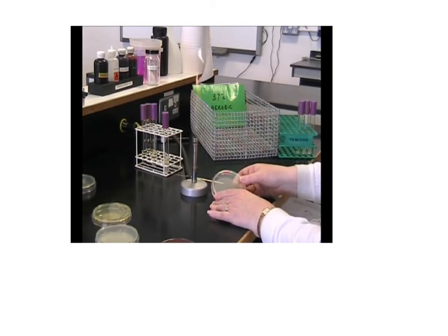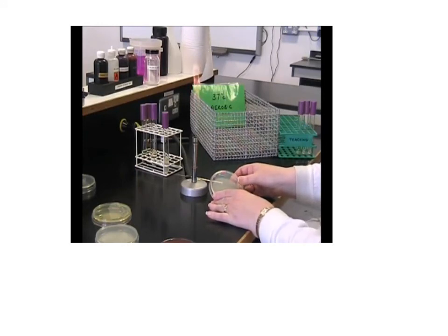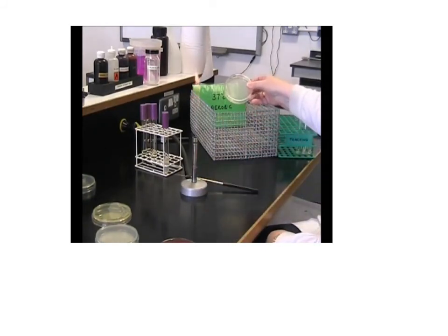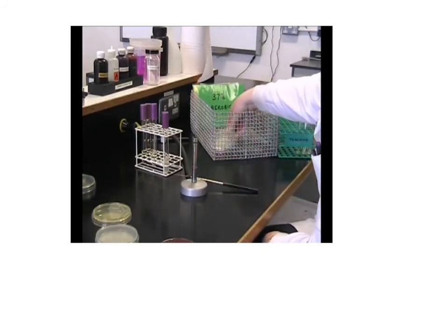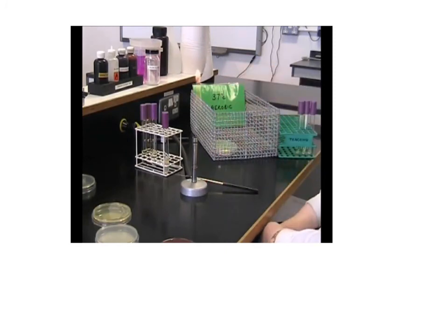When you've finished streaking your plate, label it with your initials, the type of media, and the date. This will enable you to find your plate in the next practical. Then place your plate inverted into the basket with the appropriate label and temperature. You need to incubate your plates at the appropriate temperature. Think also, do I need aerobic conditions with oxygen, or anaerobic in the absence of oxygen?